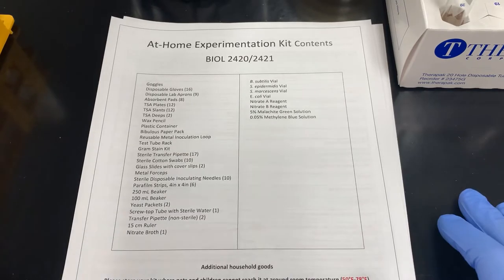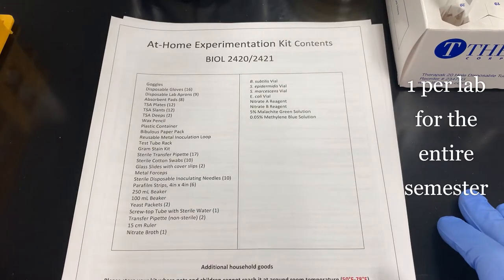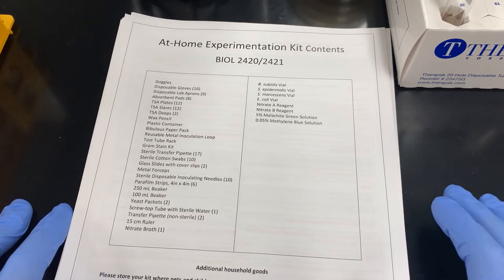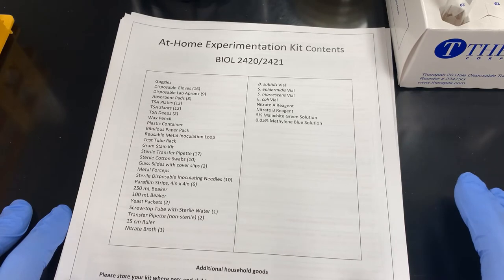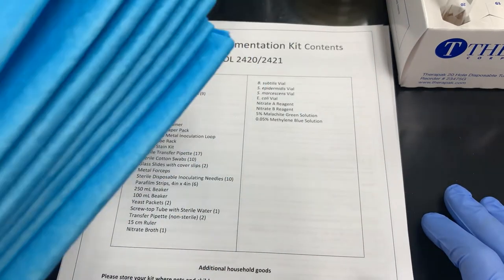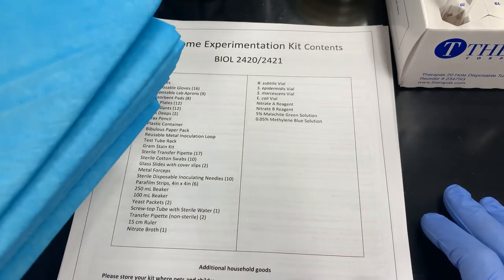Next is disposable lab aprons. You're going to find a little rubber banded set of 9, okay? We give you one per lab, plus one extra. If it's not dirty, you can reuse it for multiple experiments within the lab. This, again, would be great if you did most of the experiments or all of the experiments at one time, okay? After that is the absorbent pads. We're going to give you 8. This is more than you need. Again, if you do all the lab experiments at one time, we're giving you 8.